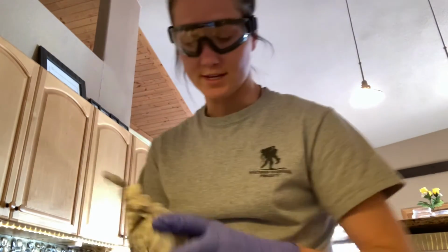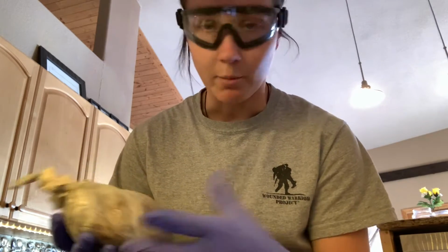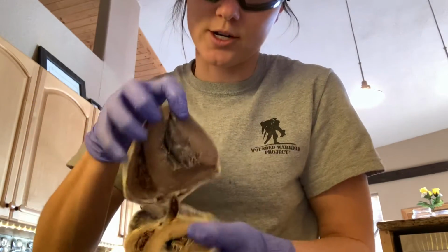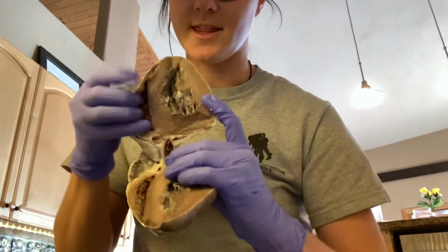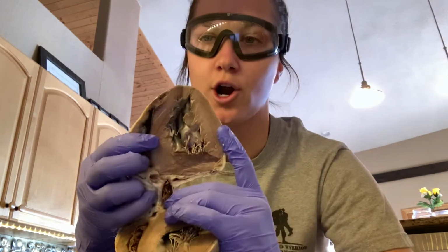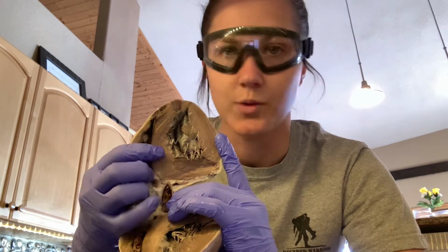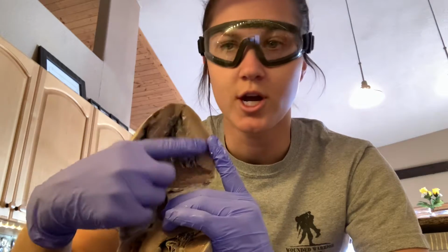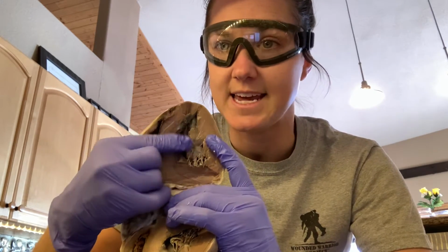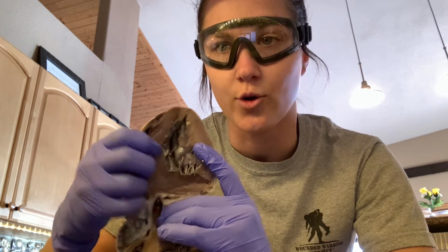So this outside layer is called the epicardium. Epi, outside, cardium, heart. Epicardium is this outside layer of the heart. Then as we move into the heart, as you can see, this bulk portion here, this big meaty portion, is called the myocardium, and this is where all of the heart muscles reside. So this is where we get to the gap junctions, desmosomes, transmitting of all the electricity. This is the myocardium. Now, going into the inside here, this is one of the ventricles. The inside layer is called the endocardium.